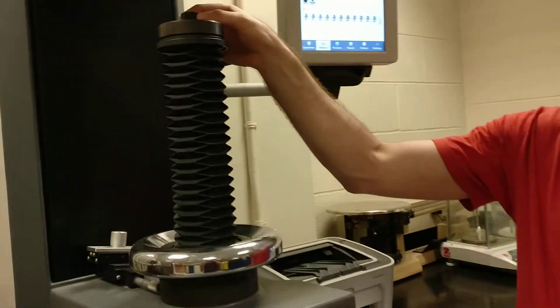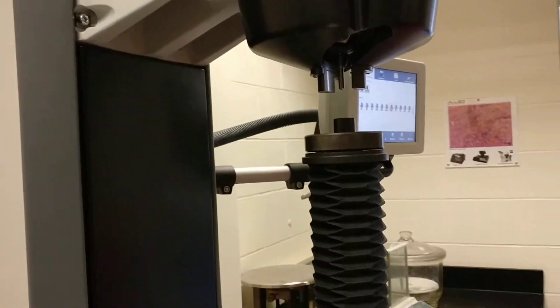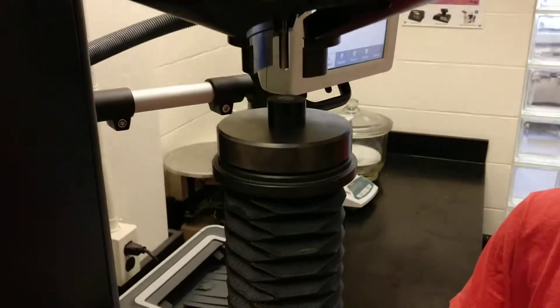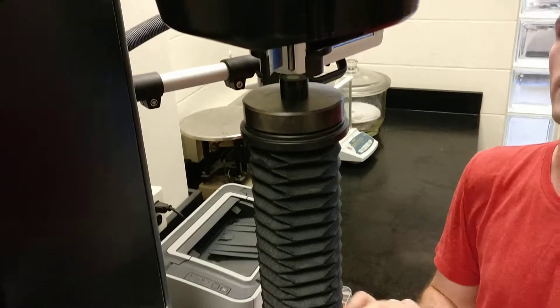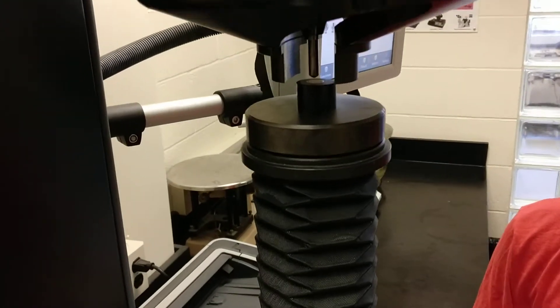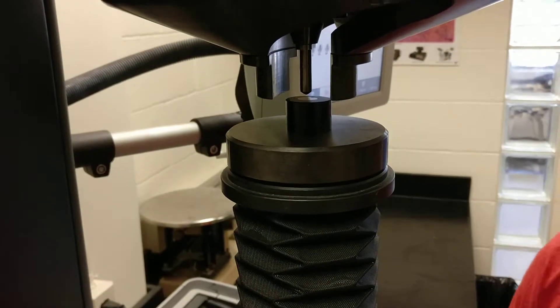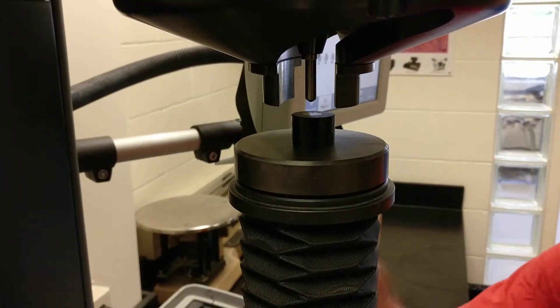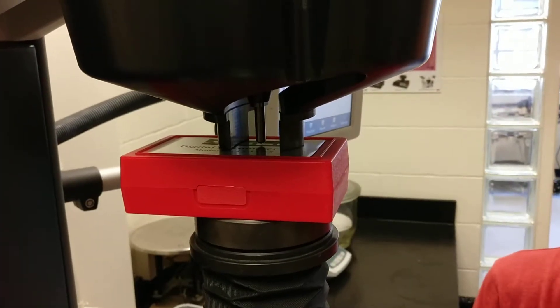First thing you want to do is put your sample up on the top here. You want to center it under the indenter, and you can use this telescoping thing to raise the height of it up. One thing you don't want to do is raise it too high — these guards show you the maximum height that your sample should be, so if you had a much thicker sample it would prevent you from hitting the indenter if you tightened it all the way up.